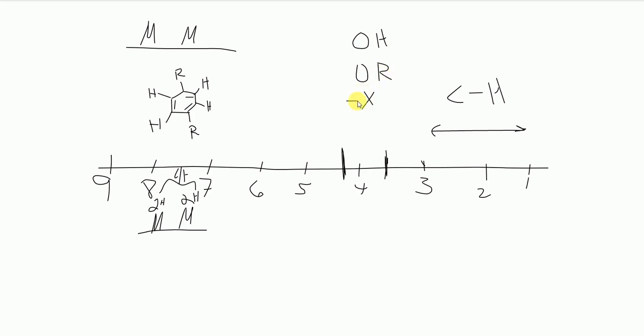Okay? And so this means that, let's say I have an integration like this, right? And let's say I have a 2H over here, okay? And I have 2 peaks, that means next to another hydrogen. So it means I have a CH2 that's next to a CH, but this means it's also next to something that's very electronegative. So there's also an oxygen bond over here.